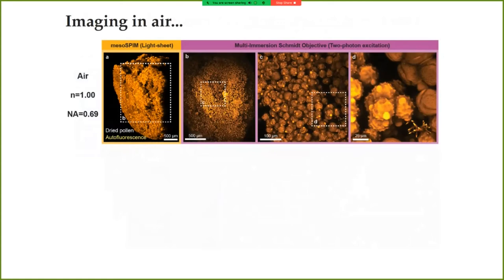Now, we can take this objective and do a variety of imaging tests with it. And one example is that we take a bunch of dried pollen, so this is a grain of pollen, each of these little dots is an individual pollen grain and they're dried together to form a kind of larger grain. And we can do an overview, in this case imaging autofluorescence with a mesoSPIM light sheet microscope, just to generate a basic overview of what the sample looks like, what the topography is in order to select a ROI for imaging at higher resolution. And then within this overview data set, after transferring the sample to our multi-immersion Schmidt objective, we can then image it at higher and higher zoom, and you can see then at some point you will see nicely the surface features of these pollen resolved.